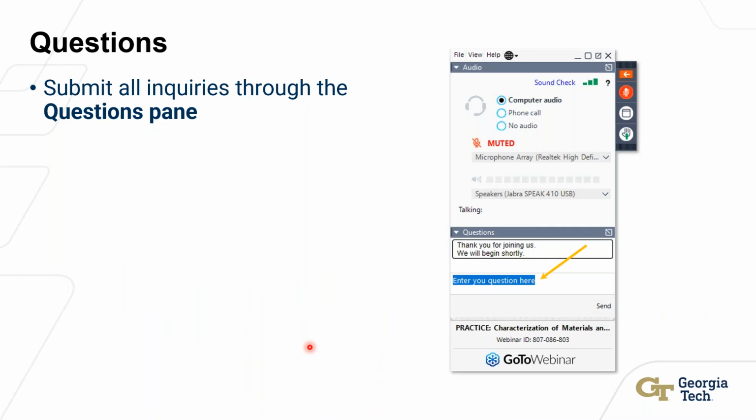Okay, nice. Yeah, and I'll just add one more note there about the direct detection: all of Gatan's direct detection cameras are also doing what we call counting. So they're direct detection, but they're also locating these individual electron events one by one.